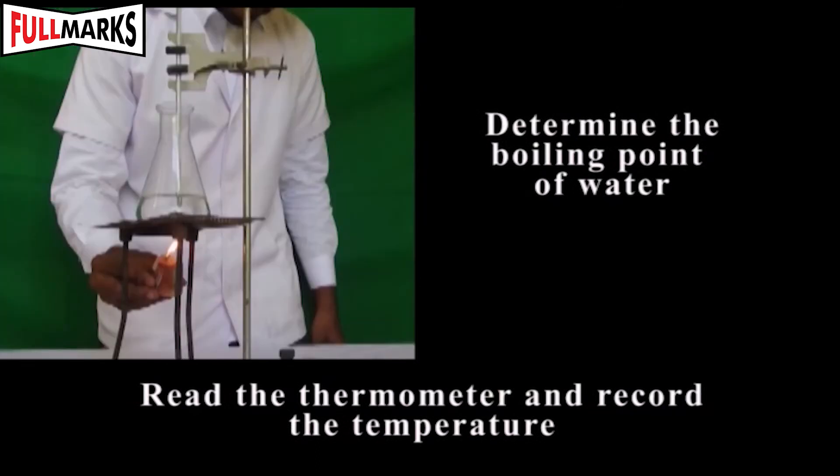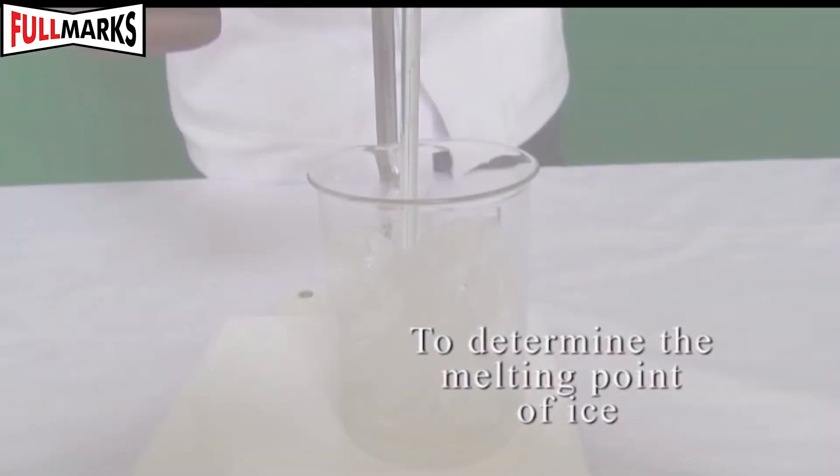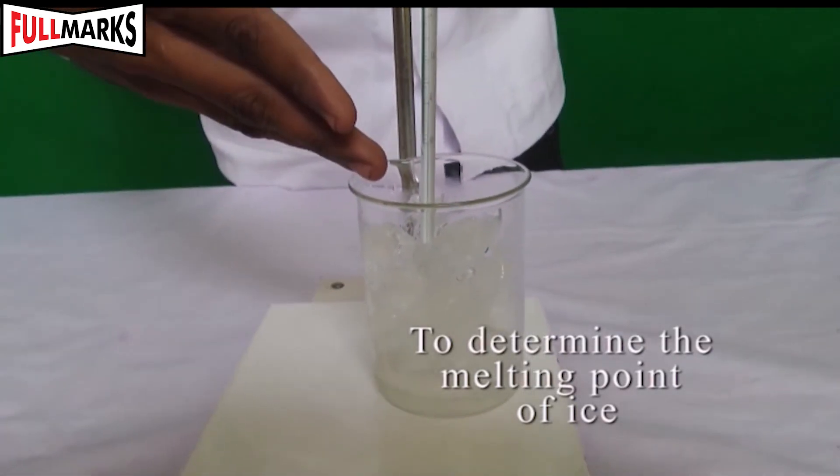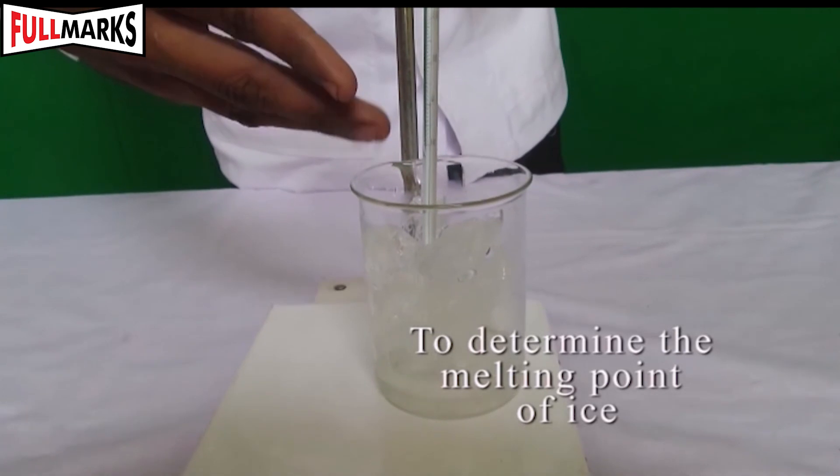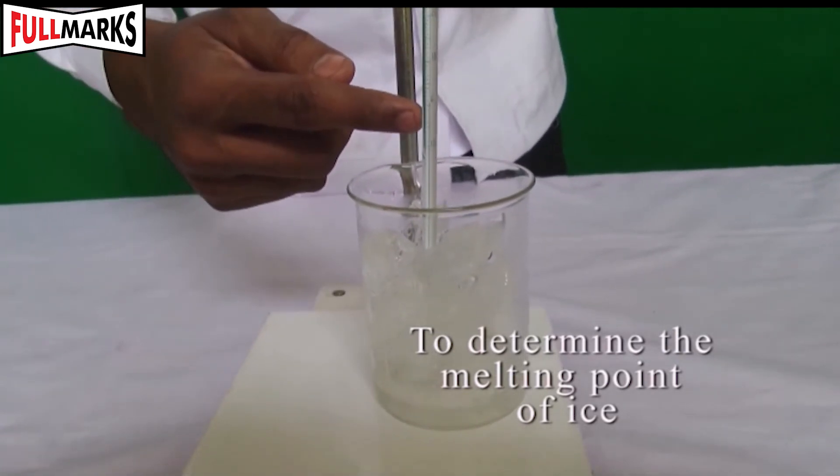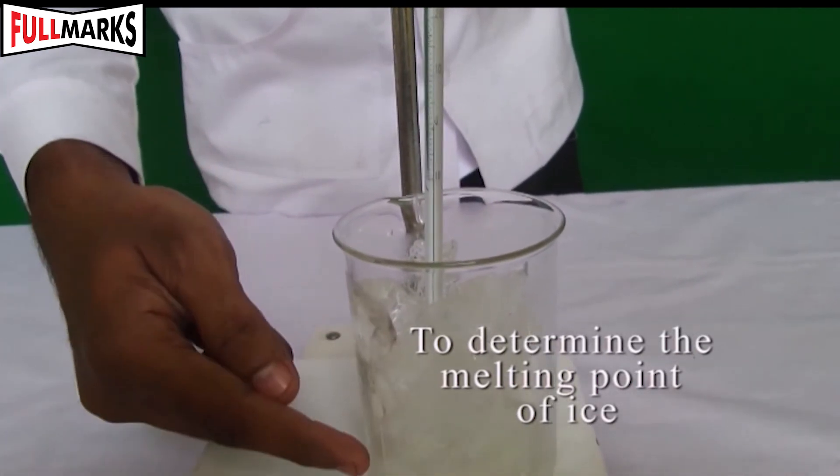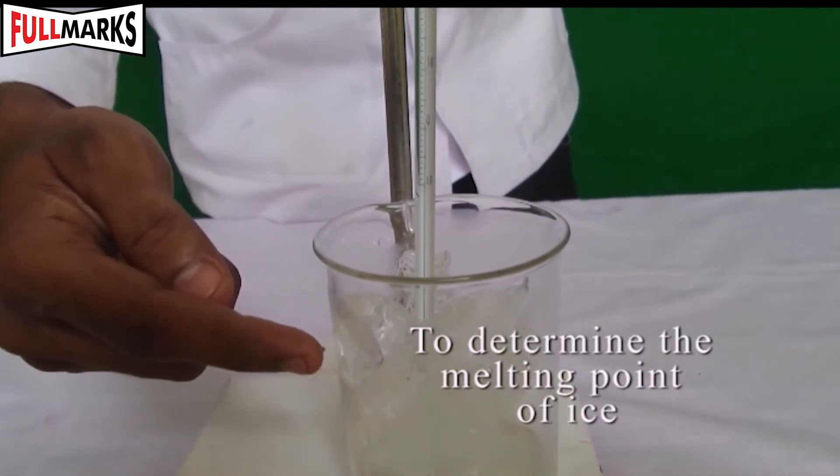To determine the melting point of ice, take a beaker half filled with dry crushed ice obtained from distilled water. Suspend the Celsius thermometer so that the bulb is completely surrounded by ice.